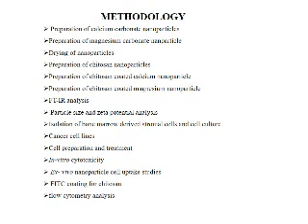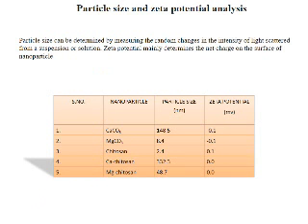Methodology includes the preparation of the nanoparticle, FTIR analysis, particle size and zeta potential analysis, cell preparation and treatment, in vitro cytotoxicity, ex vivo nanoparticle cell uptake study, FITC coating for chitosan, and flow cytometer analysis.